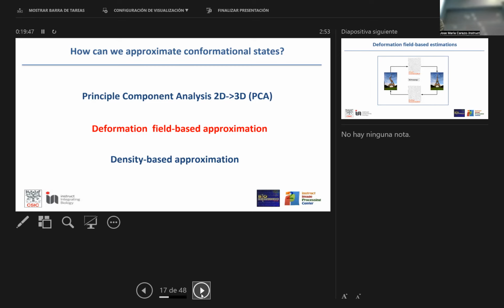It is made of 23 chains, and it just happened that in your sample, not 100% of the specimen have this chain. So some proteins are missing in some of the projections. Okay, I cannot model that as a flexible field. So if I have that situation, which could happen also, I have to do something else. And this something else is the density-based approximation.